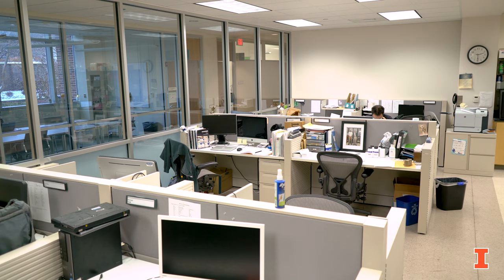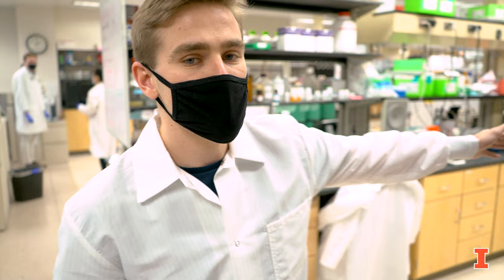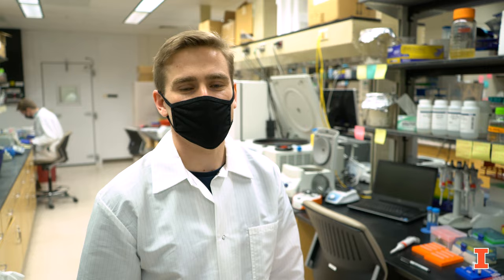Over here we have where all the computer work and the data processing takes place. Down all these aisles we have all the benches where all the wet lab work takes place. People generally spend about half and half their time doing the data processing and also doing wet lab experiments.